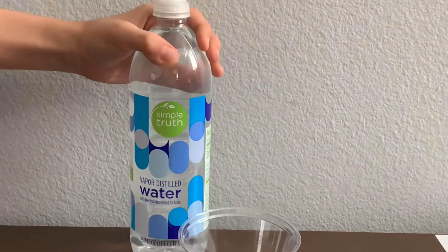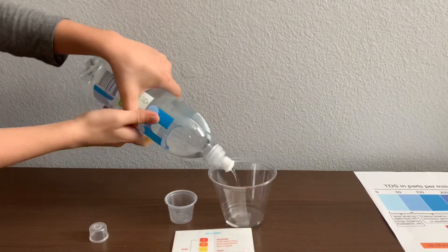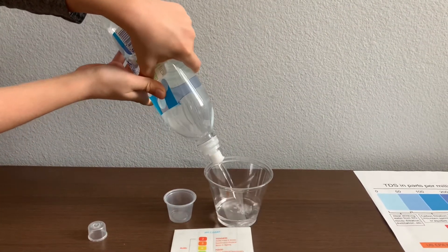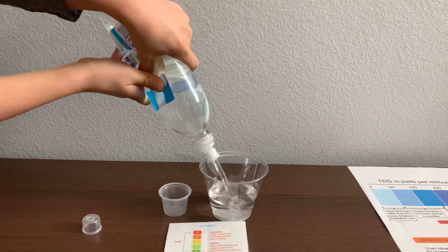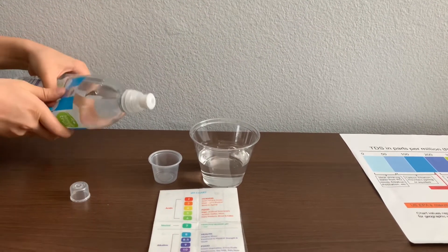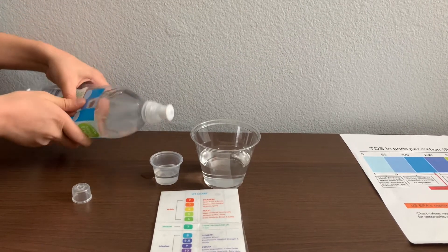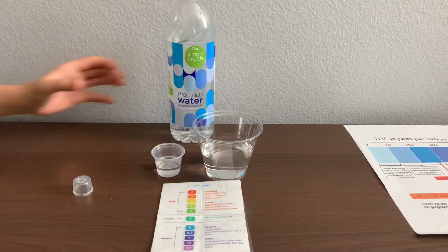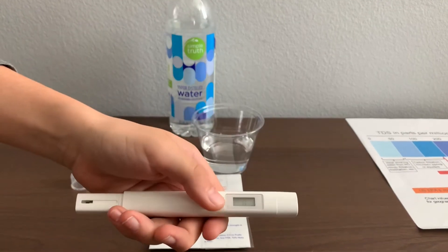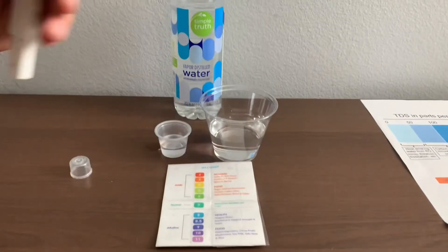Let's test the pH and TDS levels. Let's pour some water in. First let's test the TDS level — turn on the TDS tester, make sure it says zero, and put it in.